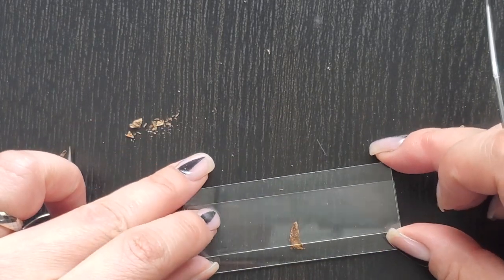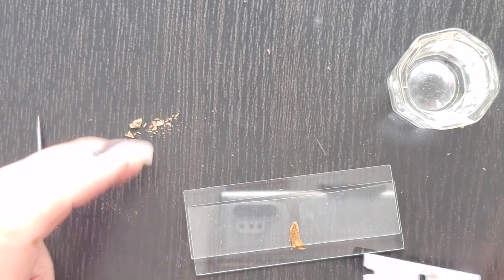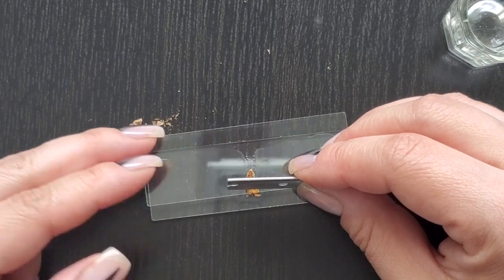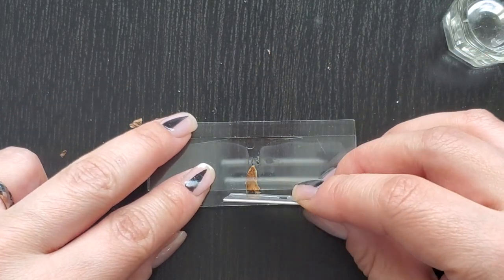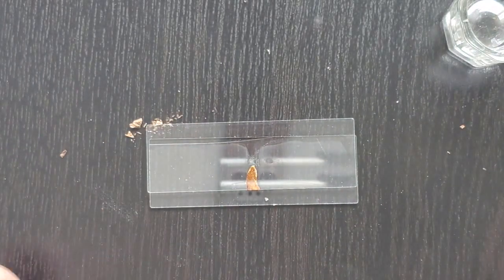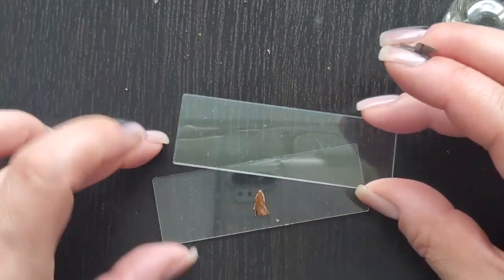So the way this method works is you hold down your piece. The first one is guide, so that you're going to use this edge as a guide to, let me know what the camera sees. Okay, so you're going to use this slide to guide you in the direction that you're going to cut. And like I said, the first one is just the first one. You're not going to use that at all. So now everything's flush, and now we're going to have to start moving the top slide back as we start consuming the actual tissue by making our sections. So we're going to move back.